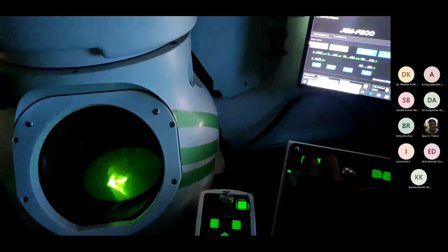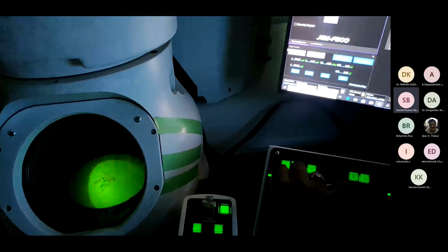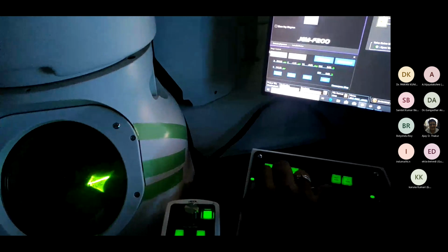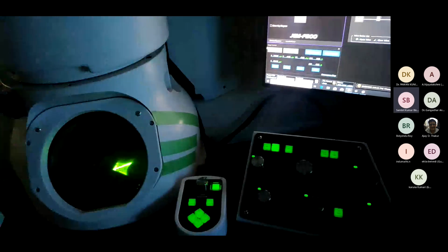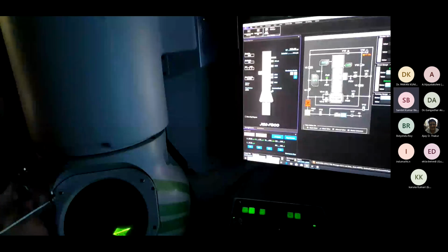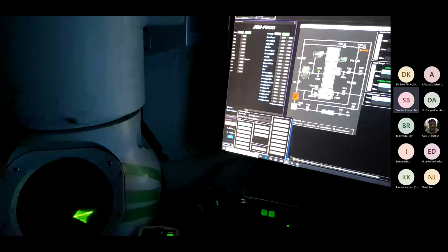It is a highly defocused beam right now, you can see. Standard focus. So what we have to do is go to the knob alignment, gun alignment. I'm turning on the gun alignment.